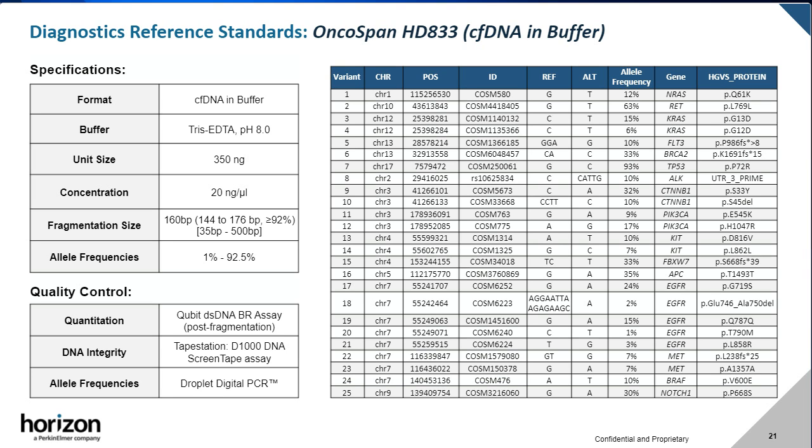Quantitation of the final product post-fragmentation is done using the Qubit broad-range assay. DNA integrity is tested using the TapeStation D1000 DNA ScreenTape assay to confirm the desired size distribution.